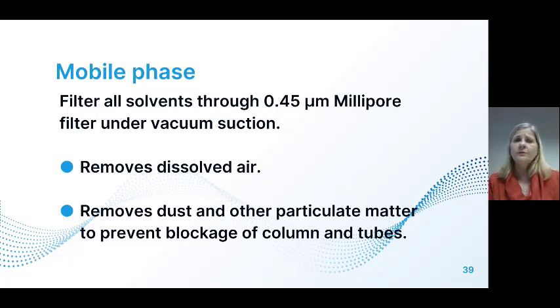I know that many of you would prepare a mobile phase, your aqueous phase, and many days later you would still use that same water phase, and it might be that you have microbial growth taking place. So if you want to use that same aqueous layer, you can just filter it through a 0.45 or even a 0.2 micron filter to make sure that you have no particulate matter inside your mobile phase.